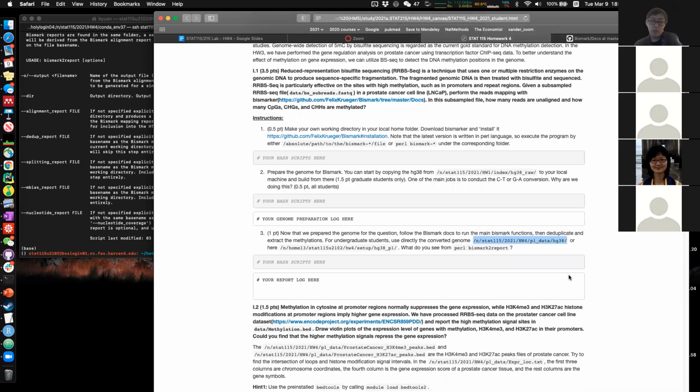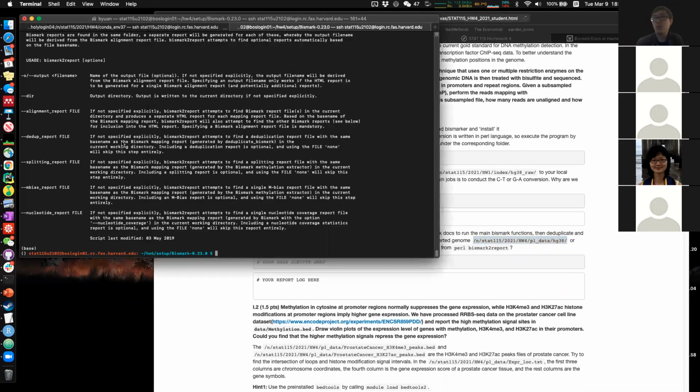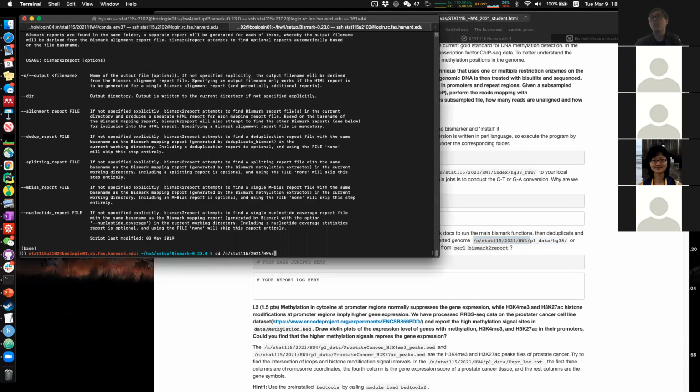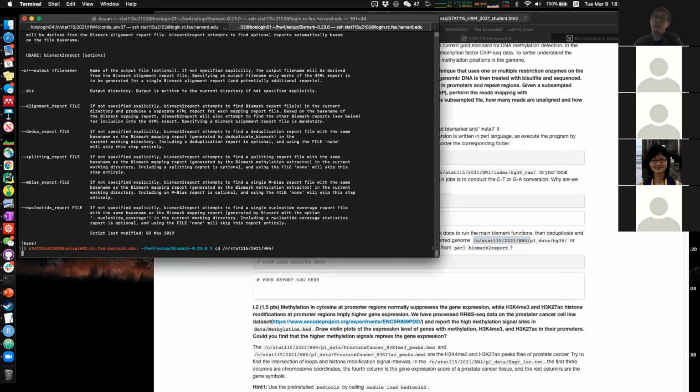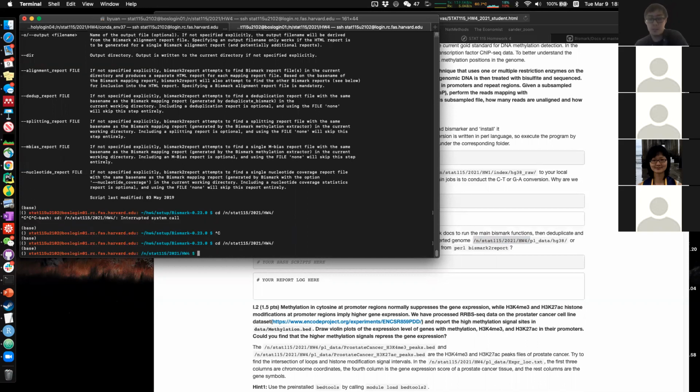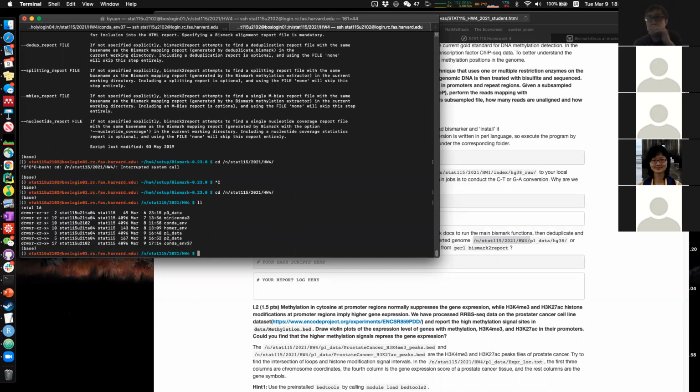Actually, by the way, let me show you what the folder looks like right now, so that you can have a better understanding too. It's taking longer than it usually does. Yeah, so this is what the folder looks like right now.